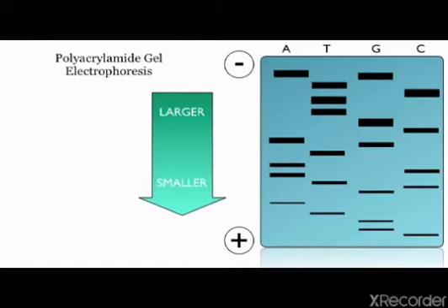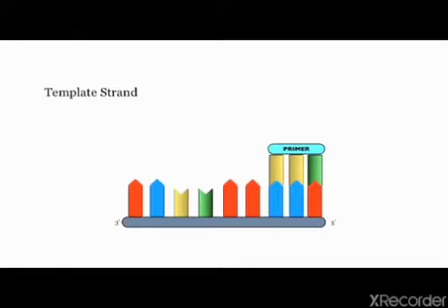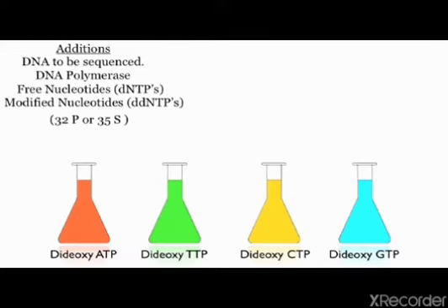Since we radiolabeled a dNTP, we can now see it show up on the X-ray film. It will show up as bands across the X-ray film, which can be used to find out the sequence of DNA. We know that each reaction mixture had the same primer, therefore all of the strands begin with the same sequence. Each chain in a particular flask ends in a sequence determined by whatever dideoxy-NTP was added to that flask.